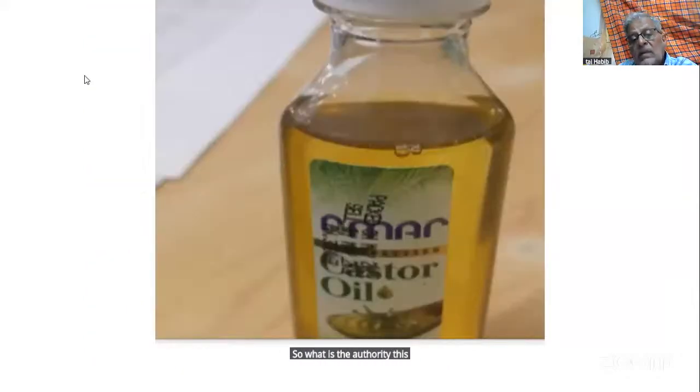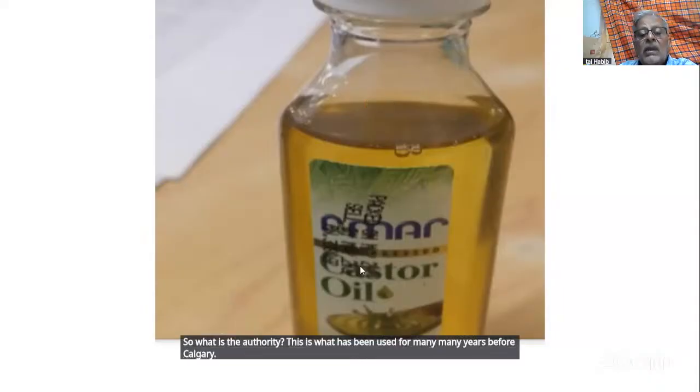This is what has been used for many, many years before Cargille came. It's just simple castor oil. It's made by 2 companies. One is Amar and the other one is Ideal.